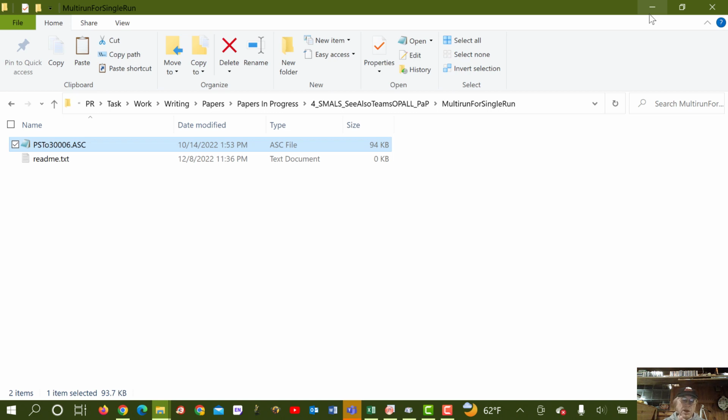If you're on top of your game, you remember to do exponential fits at the same time. You pop all that into Harvest, which is pretty much a cut and paste type of program. Boom, you have all your files, including a data set that you can drop into Origin to make pretty plots. But there are cases where you want just a little bit more flexibility, or maybe you forgot to do your one exponential fits at that time.